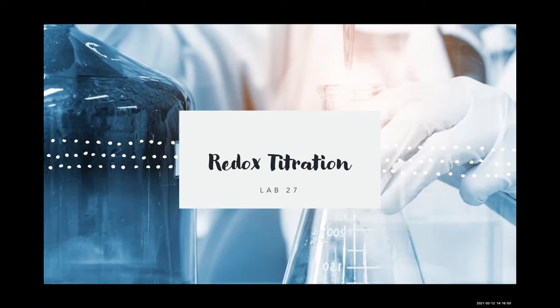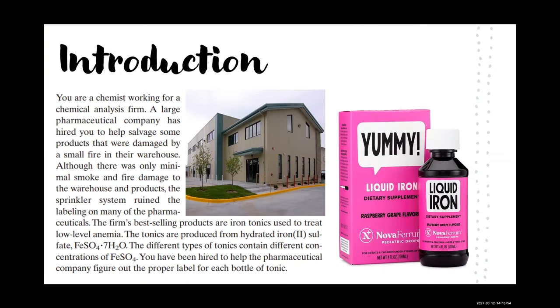Lab 27, Redox Titration. Introduction. You are a chemist working for a chemical analysis firm.